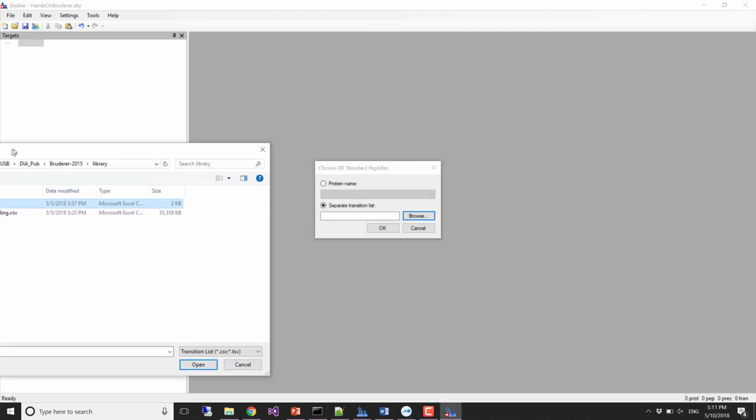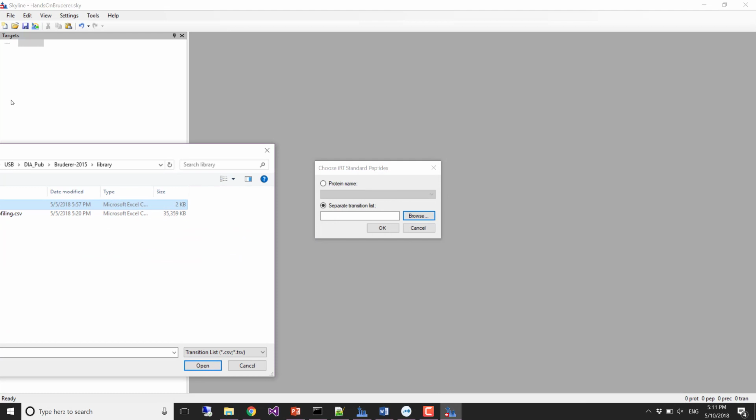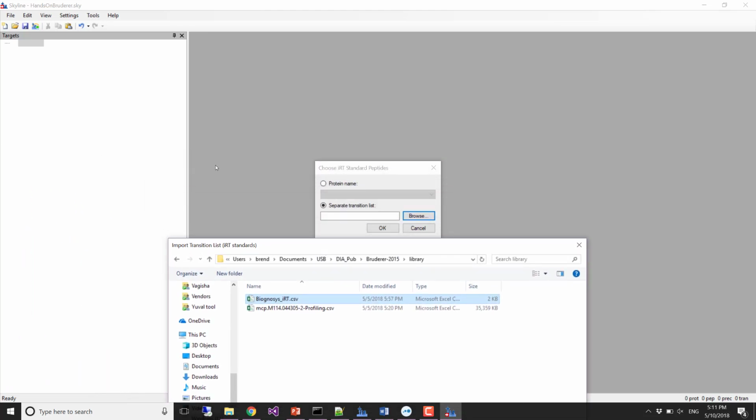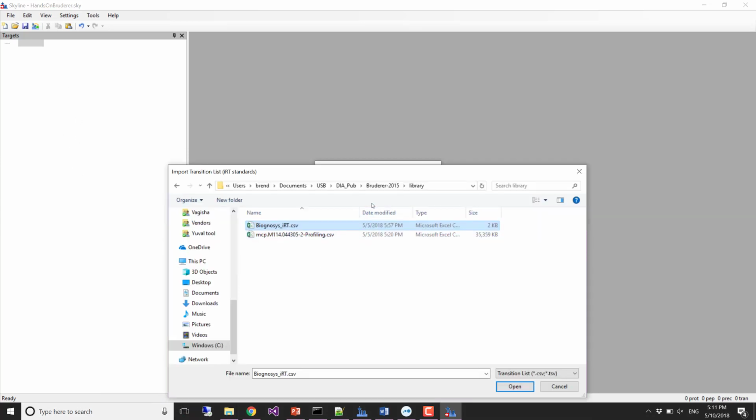You should have gotten to here right as soon as you closed it. This should have been the next thing. Did you cancel? Yeah, okay. So if you don't have any targets at this point, you better re-import.